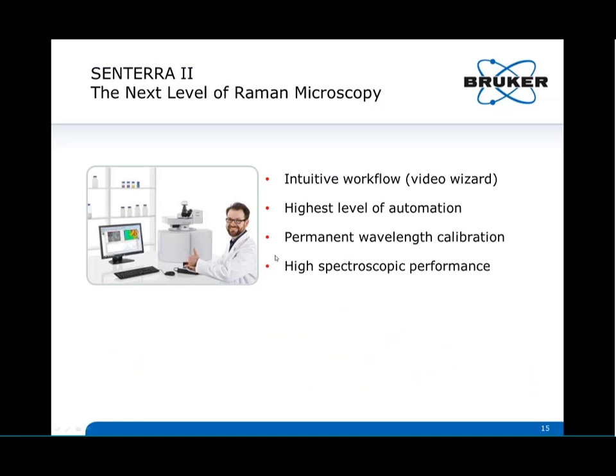Here we have the summary, which tells us that the SENTERRA II is really a system which provides intuitive workflow, essentially by the video wizard, but also by the integrated level of high automation.